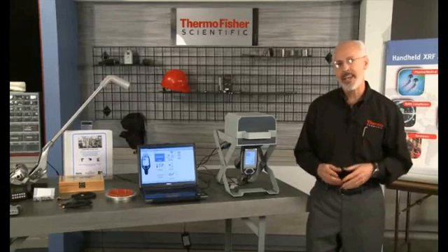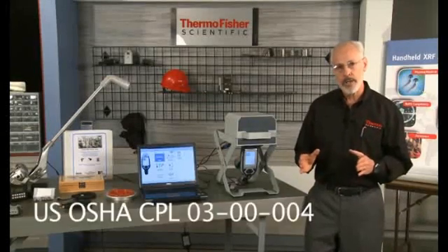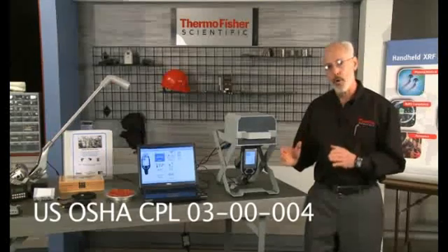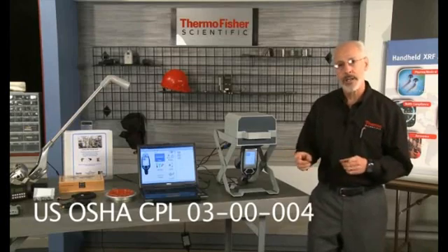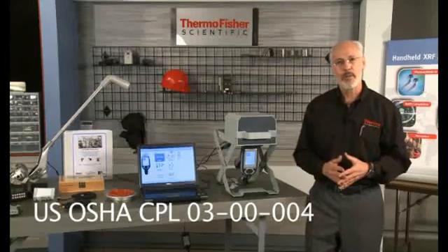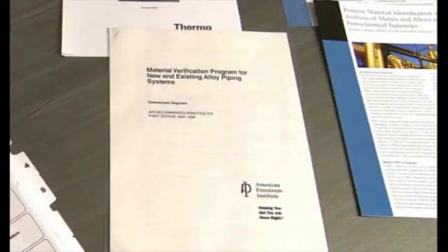The new U.S. Occupational Safety and Health Administration, or OSHA, CPL 0300004, Petroleum Refinery Process Safety Management National Emphasis Program, is an example of the type of enforcement taking place worldwide as a result. Let's talk about PMI best practices. The American Petroleum Institute, or API, has issued recommended practices called RP 578 as a guide to PMI best practices.